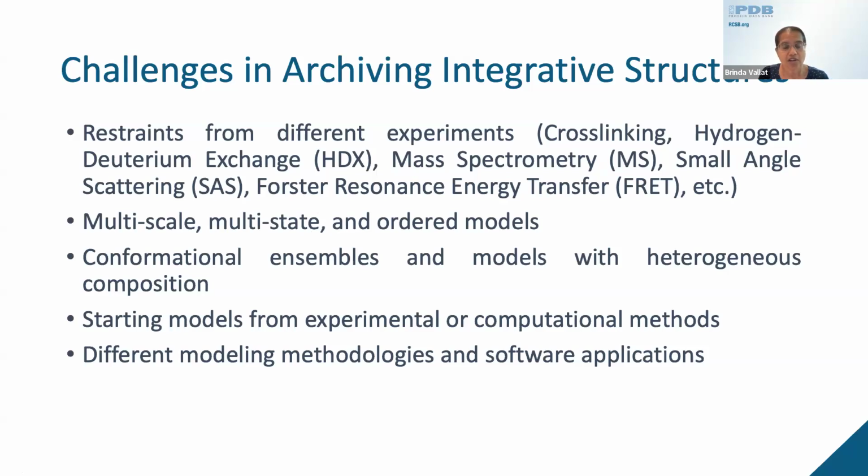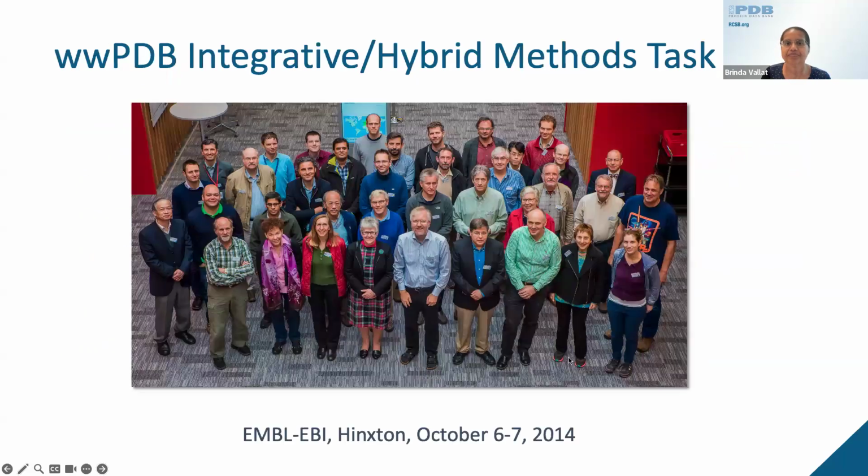They're not necessarily atomic and can consist of both atomic and coarse-grained representations. These models can also contain compositionally heterogeneous assemblies and models belonging to different conformational or compositional states. Integrative modeling can use starting structural models that come from experimental or computational methods, and they can use complex modeling methodologies and different software applications.